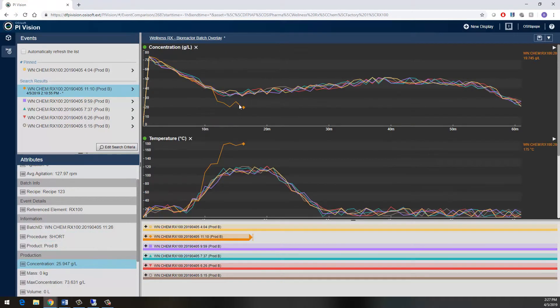Here we can see that not only is the temperature high, but my product concentration is low as well, which is a pretty good indicator that this is not just an issue with the sensor, but something is actually wrong with the piece of equipment or the control of that equipment.